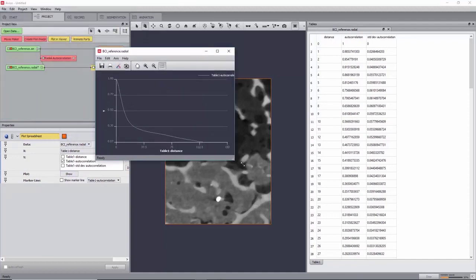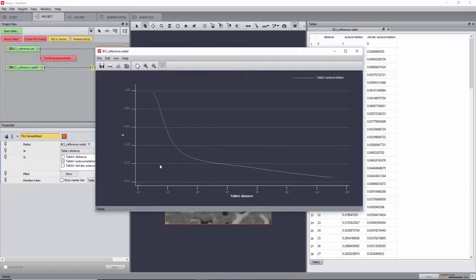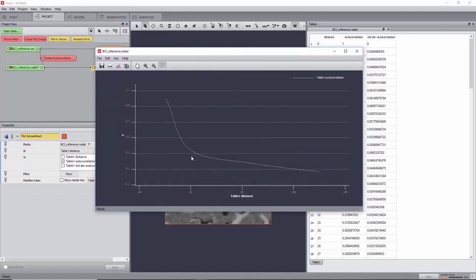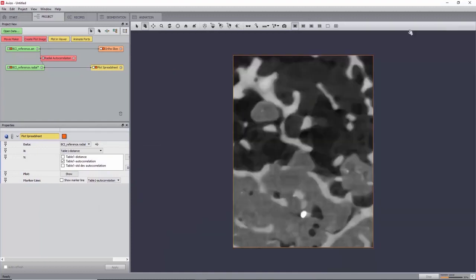The characteristic length of a microstructure can be defined as the distance for which an inflection point can be observed. Here, we can define it at around 20 voxels. As a rule of thumb, the sub-volume size for a DVC analysis should be 3-4 times greater.